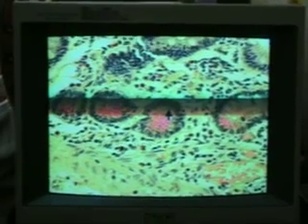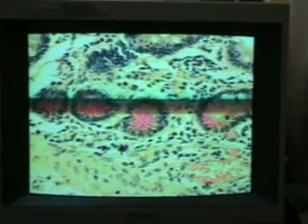They look like little flowers. If you go to higher magnification and you don't have enough light, just lift up the condenser, and then you're gonna concentrate more light to a small area, and here you see the Paneth cells in the crypt, those large granulated cells. What else do we see? We can also see lots of plasma cells and infiltrating eosinophil cells, with the eosinophil granules here, and the number of plasma cells in this area.